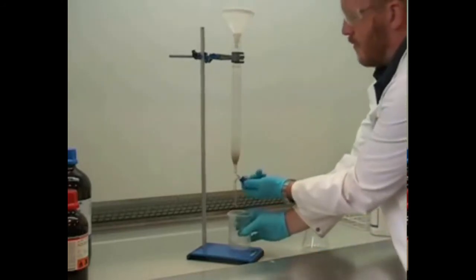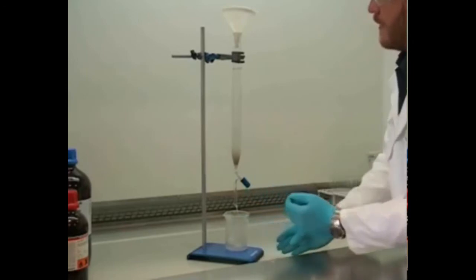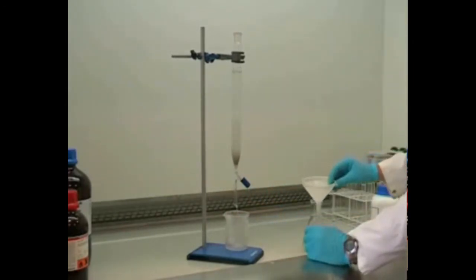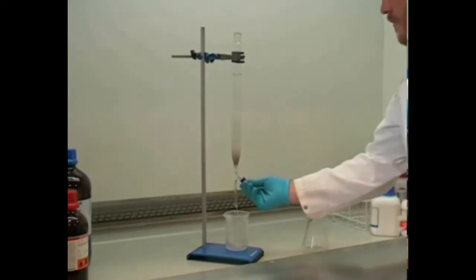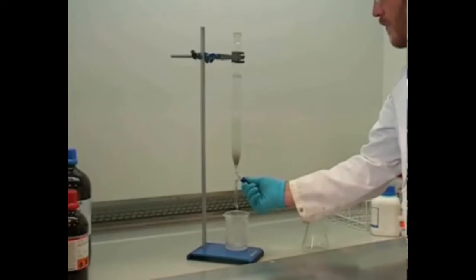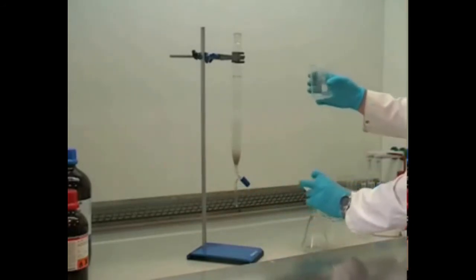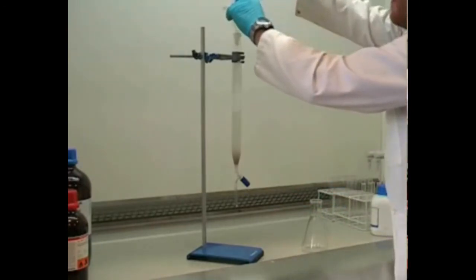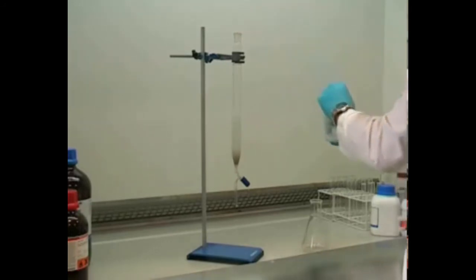Should the level of the eluent get close to the top of the column, then some of it should be removed by opening the tap. We can run this into the beaker, which will then assist us in making a slurry with the remaining silica. And finally, we've transferred all of our silica into the column.